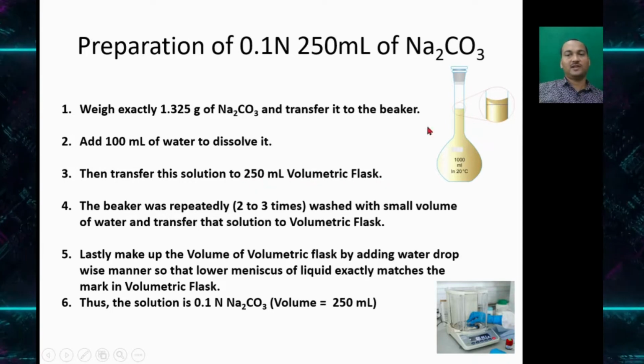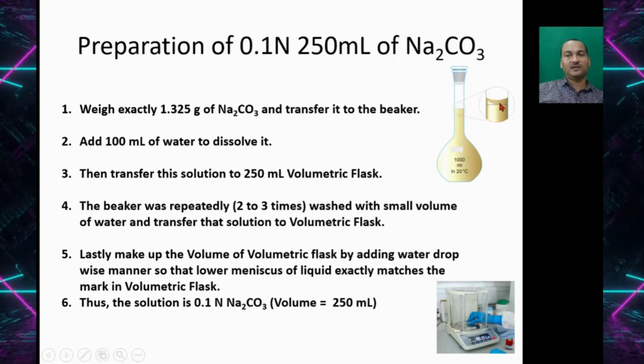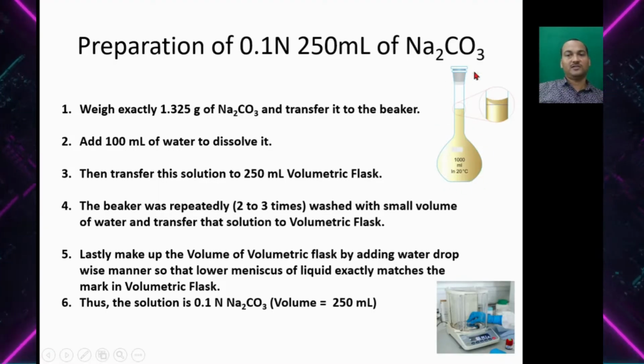So this is the volumetric flask, you can see, and here is the mark. So up to this mark, it is 250 ml. So here it is shown 1000 ml. So the volumetric flask of 250 ml is also available.